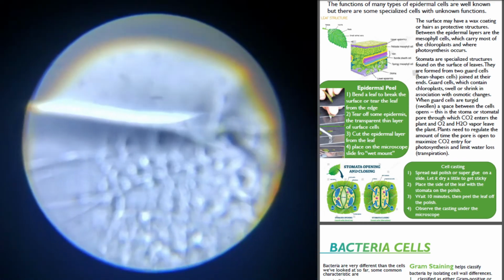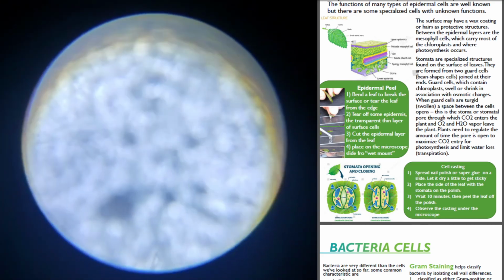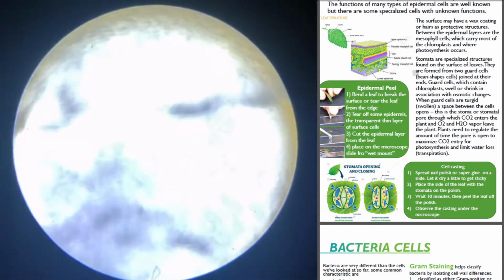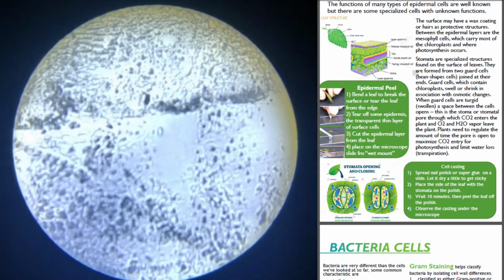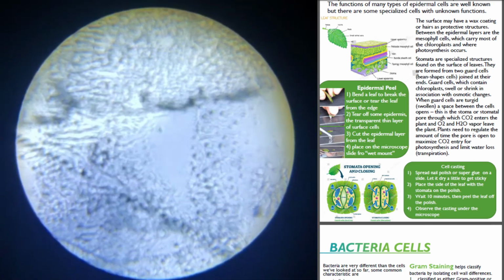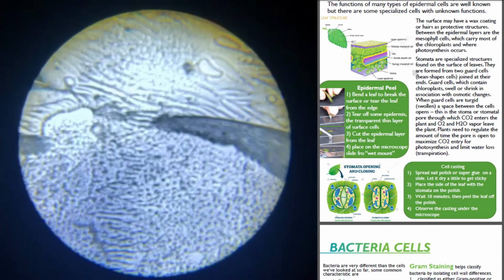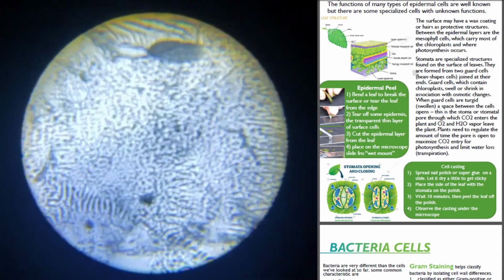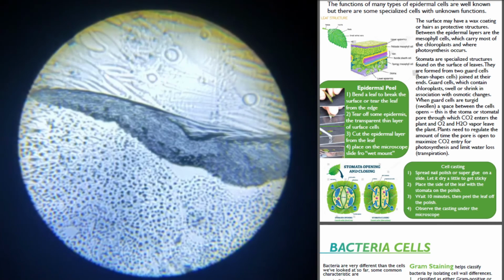Let's see if we can find it again. All right, we'll go back to scanning. Swoop, coming in, coming in, coming in. Other way. Down here. There it is.